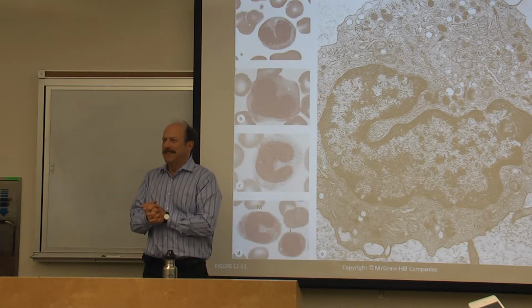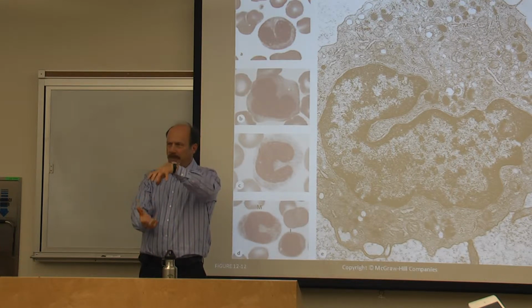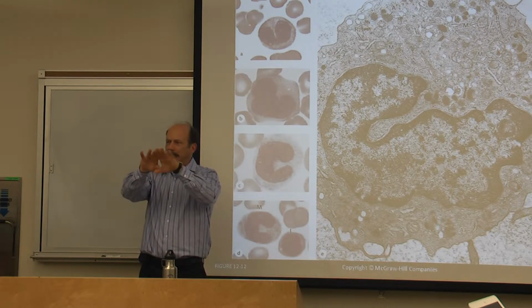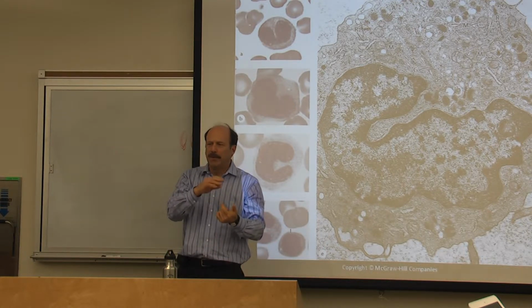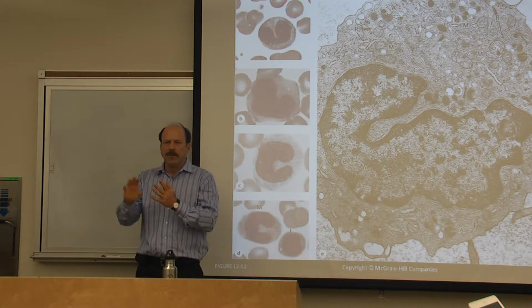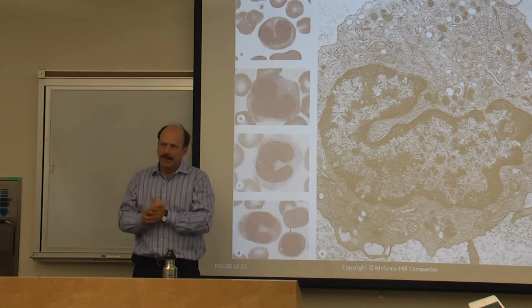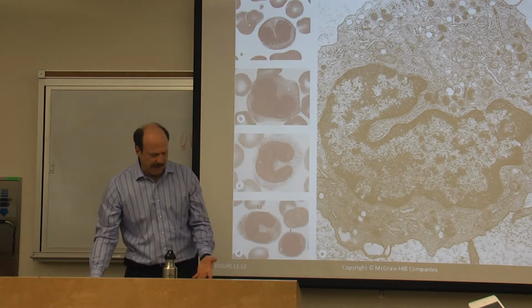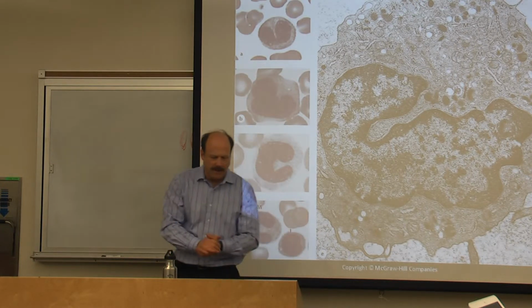So is everybody clear on that? There's the whole class of cells that are a little bit bigger than red blood cells, than erythrocytes. If they look grainy, they're granulocytes, and if they look kind of smooth, they're agranulocytes. Within the granulocyte category, there are neutrophils, basophils, and eosinophils. If they are smooth, then they're agranulocytes, and they can be either lymphocytes or monocytes. I'm going over that because you need to know that. There's some vocabulary that's needed, but it's really worth remembering. It's going to serve you well.